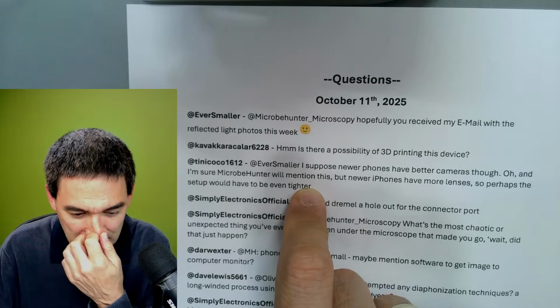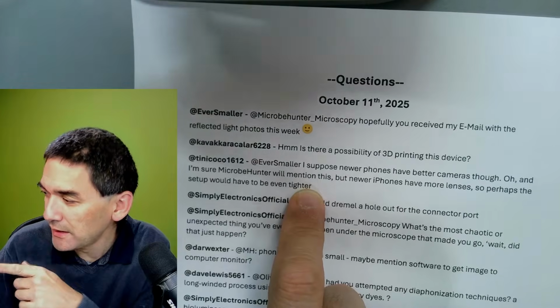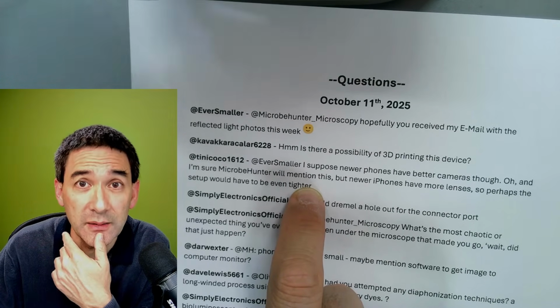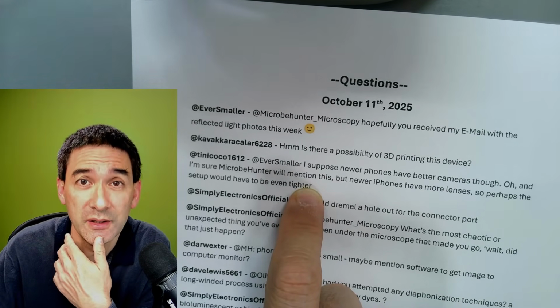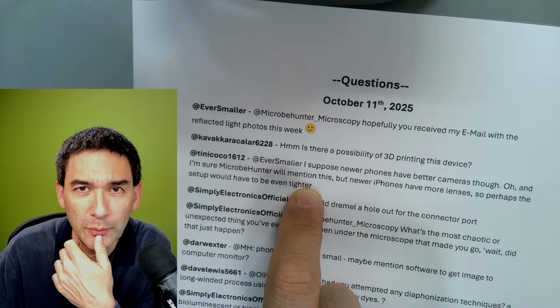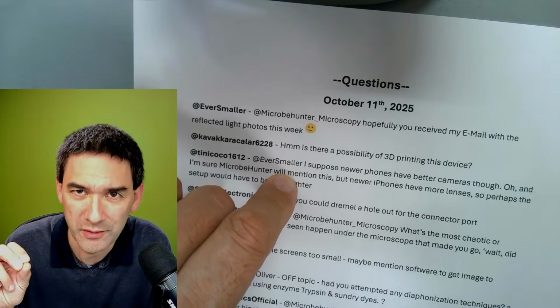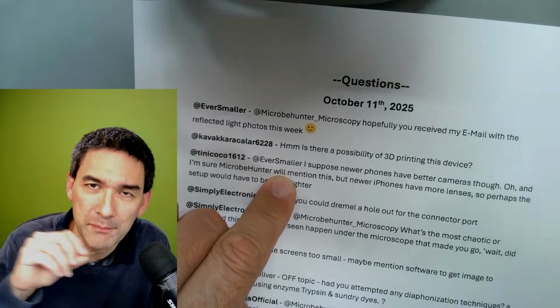Generally, I have to say the following. It's a little bit ironic. I've got a stereo microscope here, of course, and I connected cameras, USB cameras and HDMI cameras, to some of those stereo microscopes. I found out that in some cases the image quality over the stereo microscope's phototube was much worse than taking a mobile phone camera and taking a picture directly through the eyepiece.